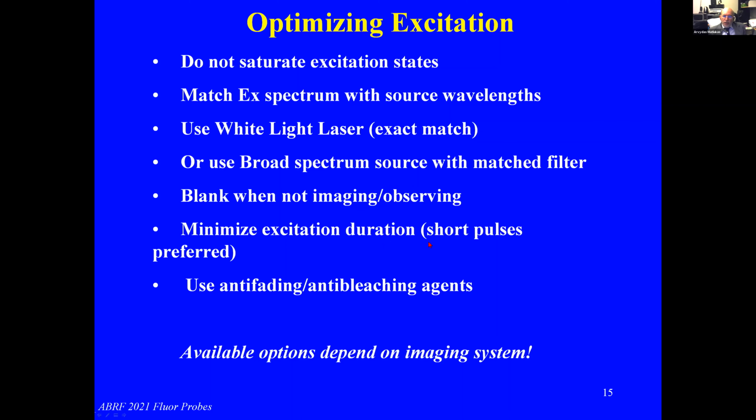We can use hardware and software averaging to decrease noise. We can use pixel binning, and we can use internal detector amplification, which also allows further optimizing signal to noise ratio. The listed options typically are instrument dependent.